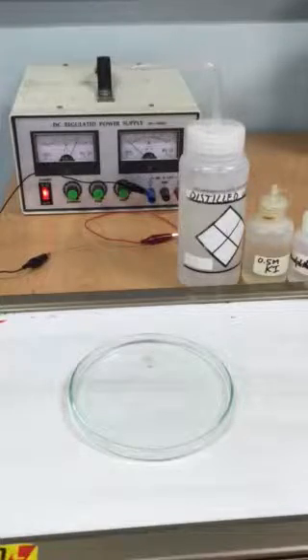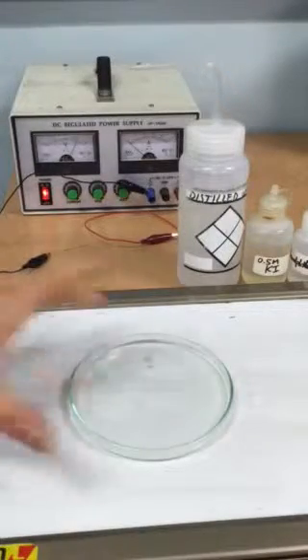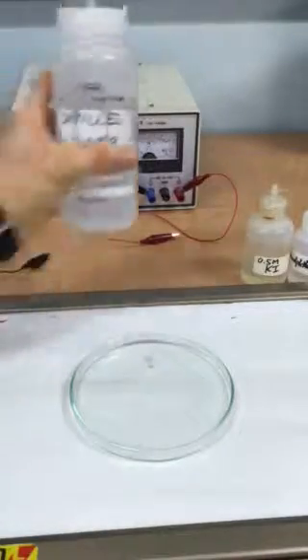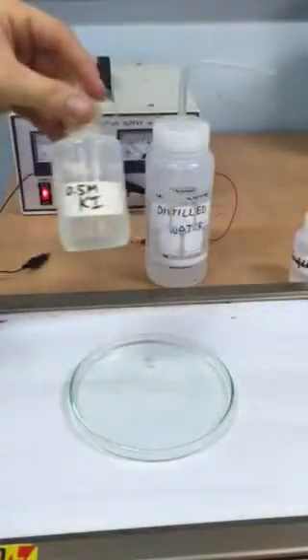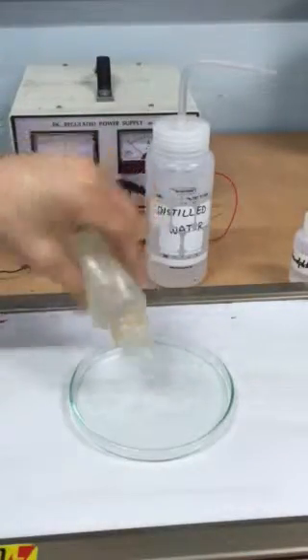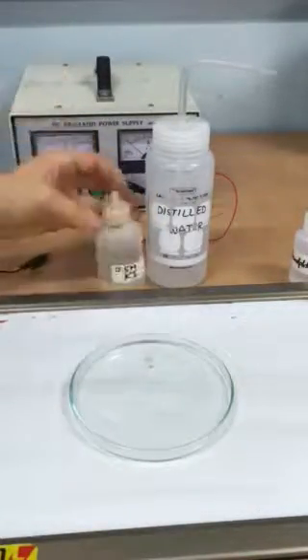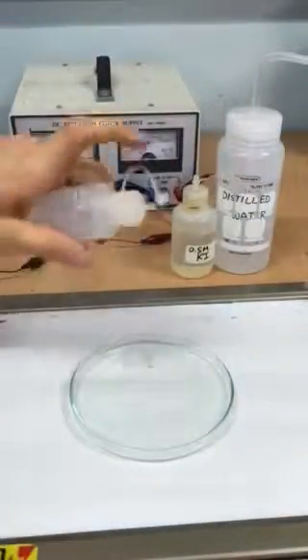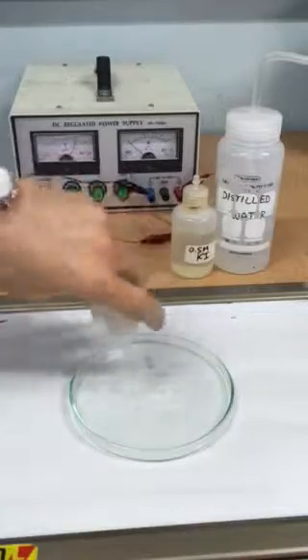So here I have some distilled water inside of this petri dish. And I also have some potassium iodide solution, half molar. Put that in there as well. I put more in there, but just showing you that it is in there. And I also have some phenolphthalein, some pH indicator. So I put that in there.